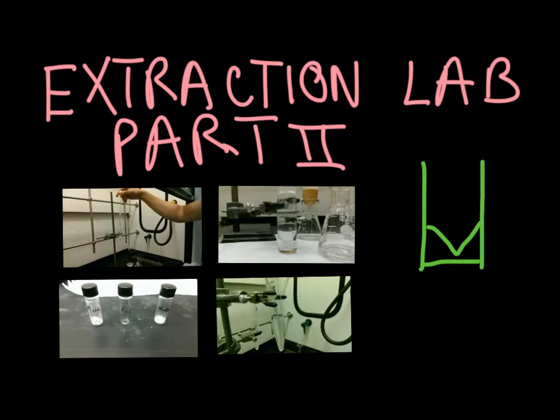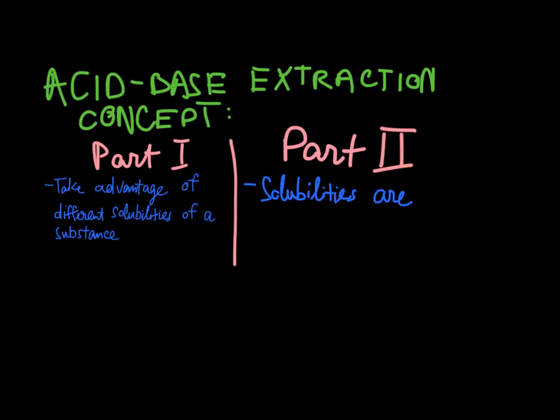Hello everyone. Today I will be talking about the experiment extraction part 2, which is the separation of acidic, basic, and neutral components in an unknown. In extraction part 1, we separate a substance out of a mixture by taking advantage of different solubilities of a substance. However, in part 2, we modify the concept a little bit. We control the solubility.